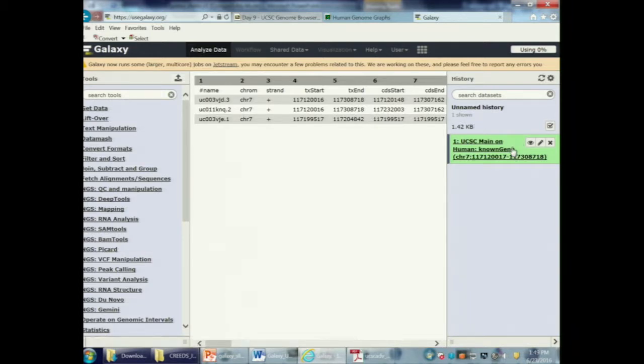So a lot of people are using this now. You can see next generation sequence analysis; you can analyze RNA-seq data here, SNP calling, all kinds of stuff. So people are doing some pretty heavy lifting. It's all run on servers, mostly in Pennsylvania somewhere, I think, so sometimes it can get a bit backlogged. Basically, anything you do will get put in a queue, and if hundreds of other people are doing lots of other analysis, that can take a while.